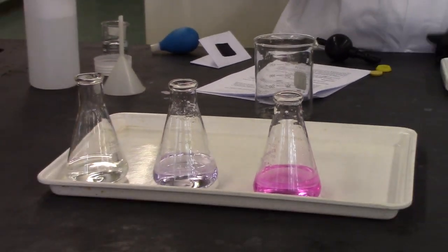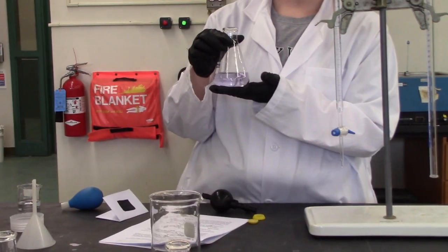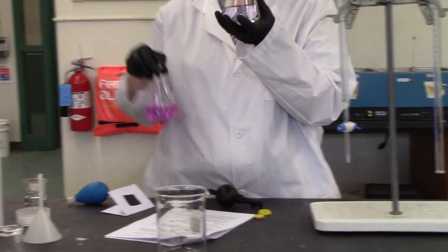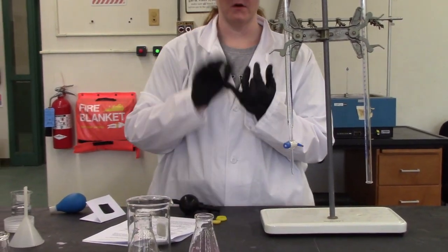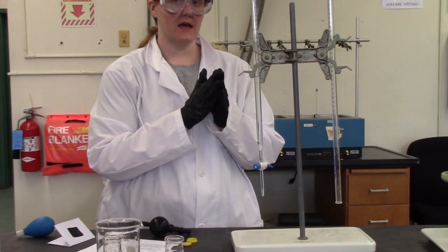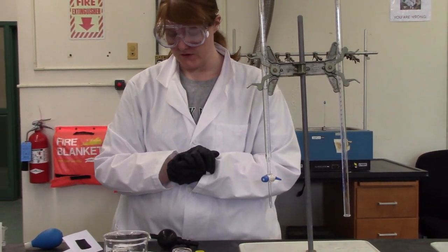So I would record my final volume here with two decimal places, all volumes on the buret, two decimal places every time. And I would also make an observation about what this looks like. Does it look more like our fuchsia color here, or does it look more like our very, very pale pink here? Okay. So that's your data for this experiment, combination of volumes and observations. In this particular experiment, I'm going to have to add together the two different buret ones that I did to get the total amount of NaOH that I put in. All right, so that's an important thing to note.